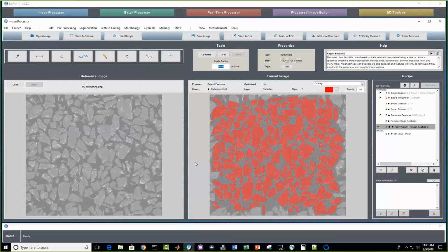In MIPAR, you can calculate your scale factors from each of those scale bar images, and you can then save that scale factor as a cal file, say 20x.cal, 50x.cal, 100x.cal, and you can then have just a library of those cal files that you can share internally, and you'll never have to calibrate magnification again. Once you have that library, there's no need to put scale bars on all your images, provided you take images at a similar set of mags and image resolutions.